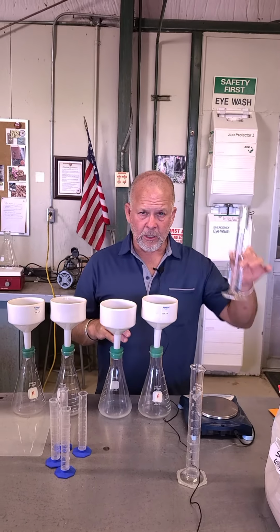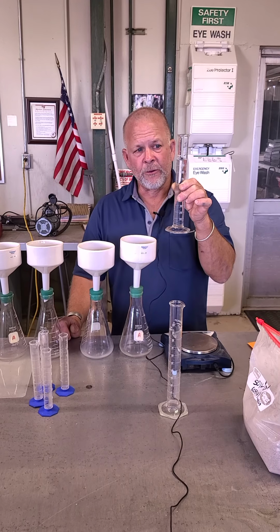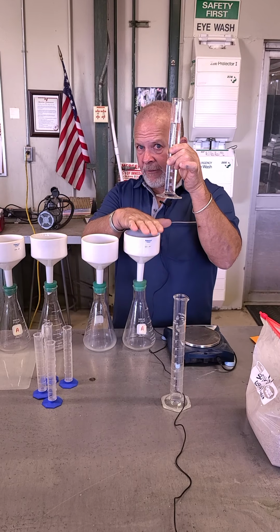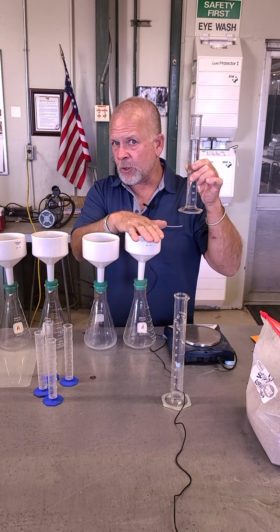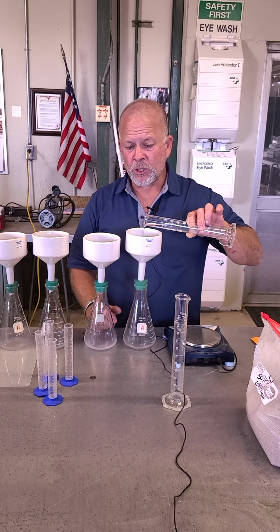So here's our first treatment. This is what we're going to do all the way around. We don't really need to video it, but I wanted to show you for the first one what we're going to do. The first treatment is just deionized water. So every number 1, on all 3 soils, one of the 4 Buchner funnels is going to get the treatment of deionized water, right? So right now we're just preparing the soil.